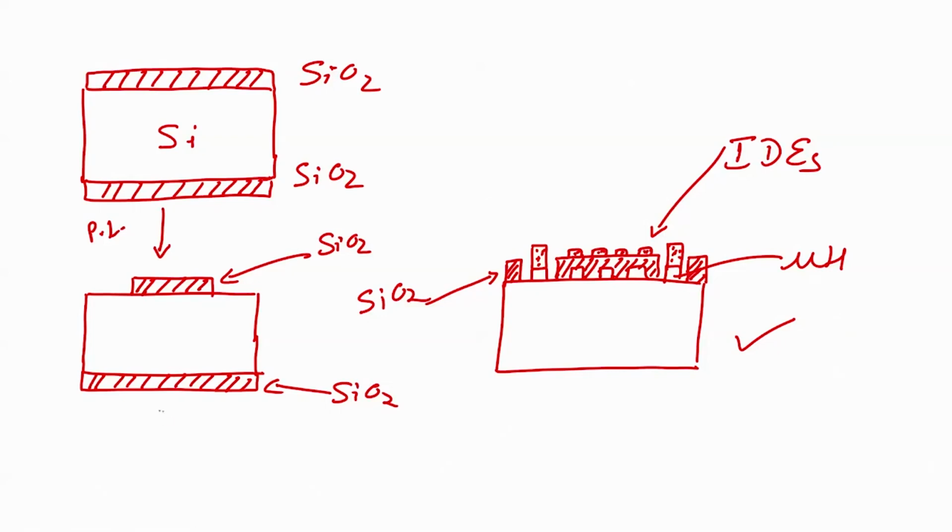Then I will perform deep reactive ion etching, DRIE.